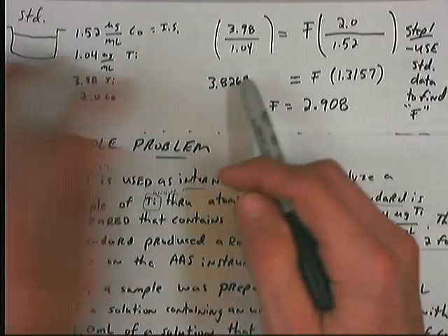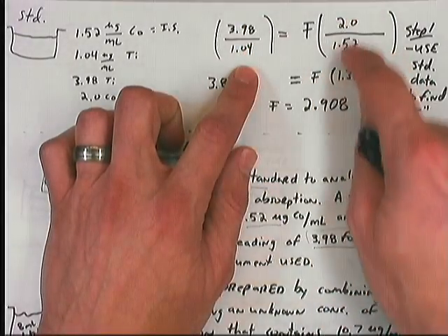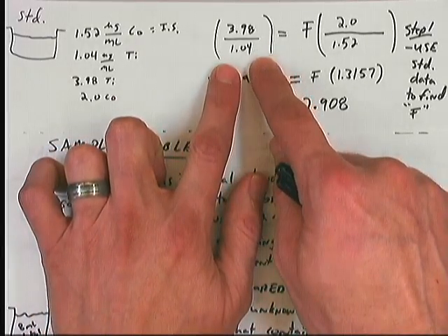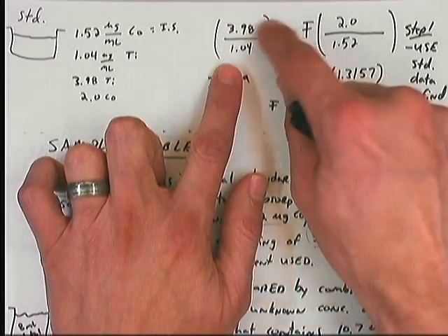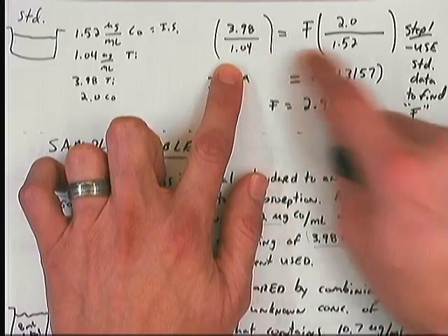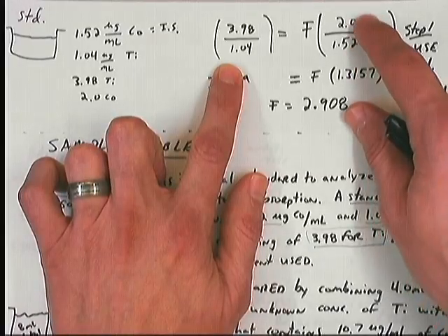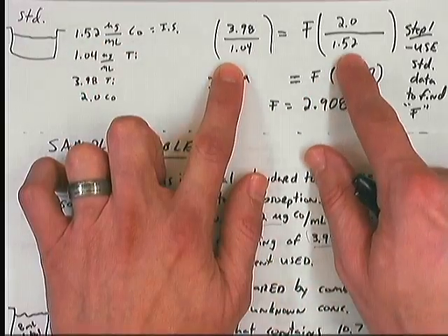Through knowledge of the internal standard equation, which was presented on that previous slide, I can then start filling in numbers for everything, as I alluded to earlier. For instance, this left side of the equation is for my titanium. That's my analyte. I have my titanium signal in the numerator, my titanium concentration in the denominator. On the far right, I've got my signal and my concentration for my internal standard, the cobalt. That's my signal, my concentration in the standard that I analyze.